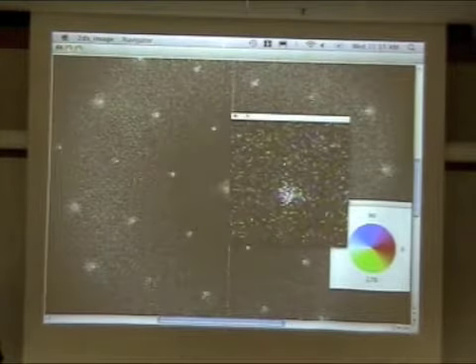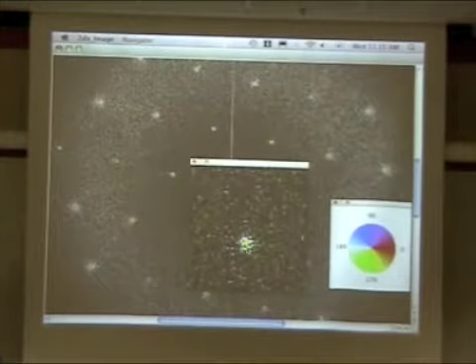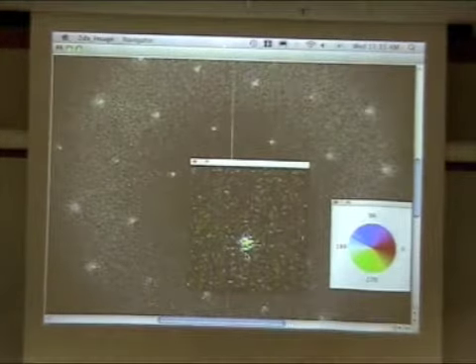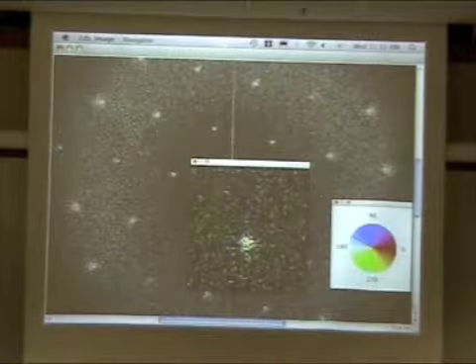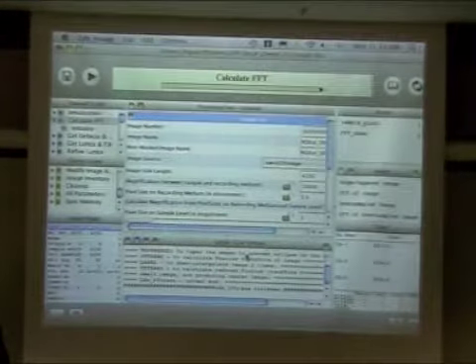and so you can see some neat things. Like for instance, you can see phase coherence, or maybe lack thereof, in these cases a little bit. And so the more centered your references are, and the closer to the phase origin you have, these things will start looking prettier. For helical processing, this is really quite useful. We don't do that yet, but this feature is in there.